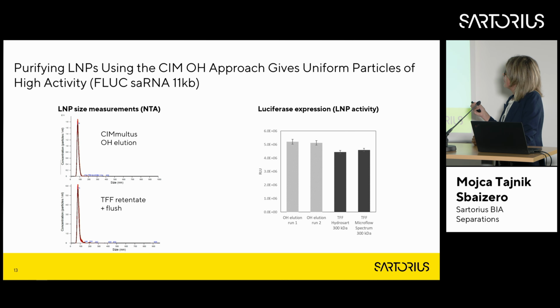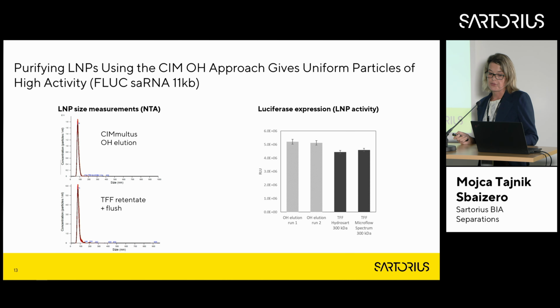And we see that in this case we also got higher activity after the OH purification, and the particles were quite comparable for both techniques, either with the OH or the TFF control.